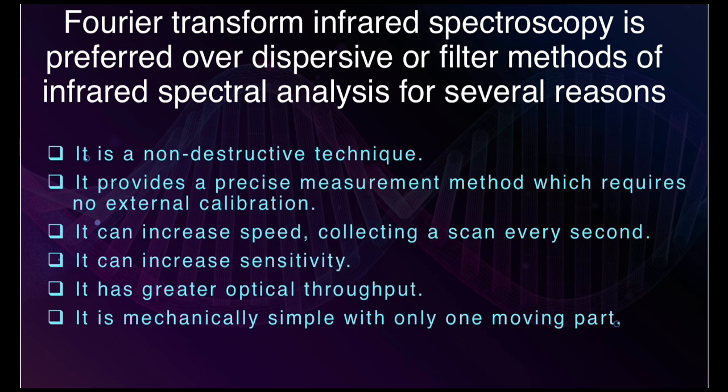It is a non-destructive technique. It provides a precise measurement method which requires no external calibration. It can increase speed, collecting a scan every second. It can increase sensitivity. It has greater optical throughput. It is mechanically simple with only one moving part.